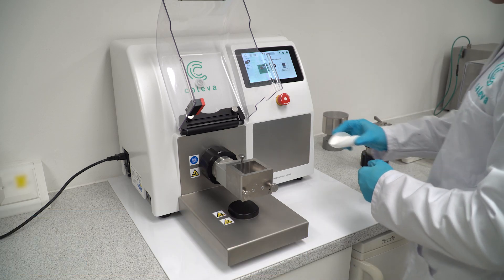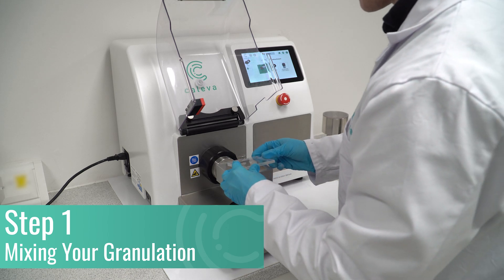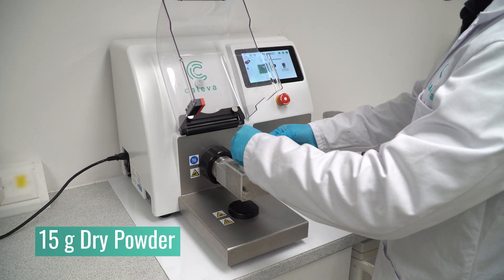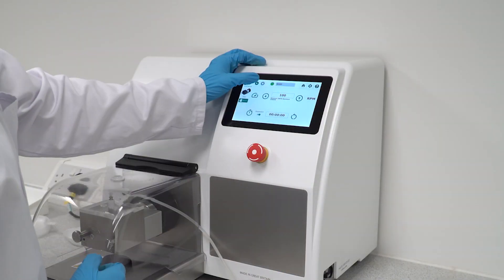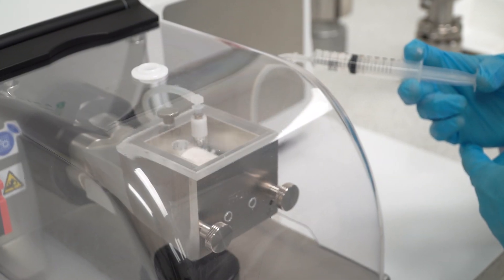The first of this three-step process is mixing your granulation. With the mixer attached, add your batch of dry powder. In this example, we are using 15 grams of dry powder. Next, add the desired amount of liquid binder.